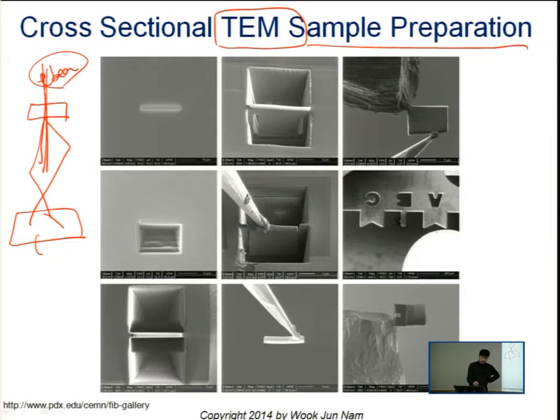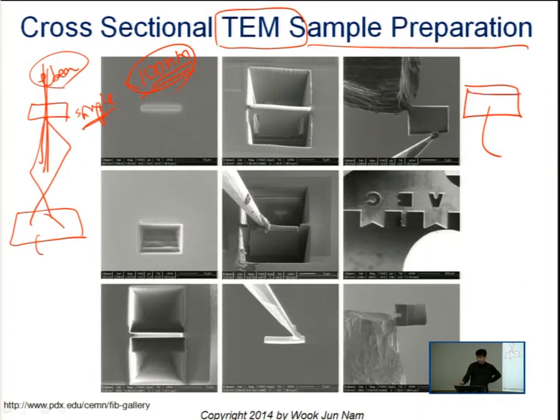So this electron beam should transmit the sample, and the thickness of the sample should be thinner than 100 nanometers.